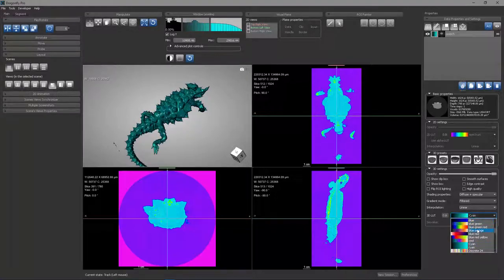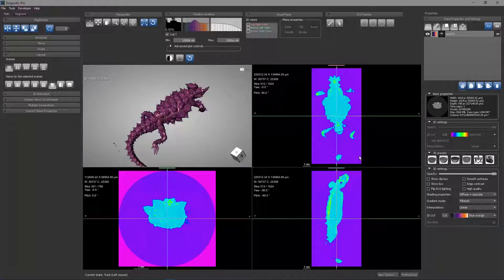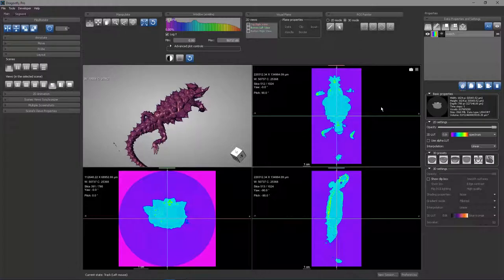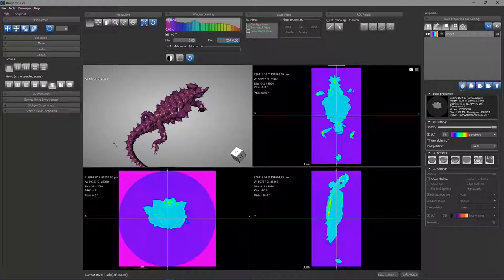Once you have a lookup table selected, it applies the coloring. And so if you look in my 2D view for a moment, you see that I have intensities in my histogram that go from 0 to 50,737. Those intensities are mapped onto color.